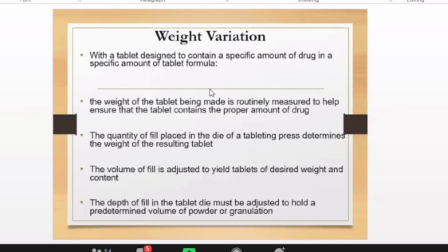Yes, Christopher. I didn't get you clear on disintegration of the tablet. When you mentioned once it's soft, then it's considered to have disintegrated, I didn't get you clear there.